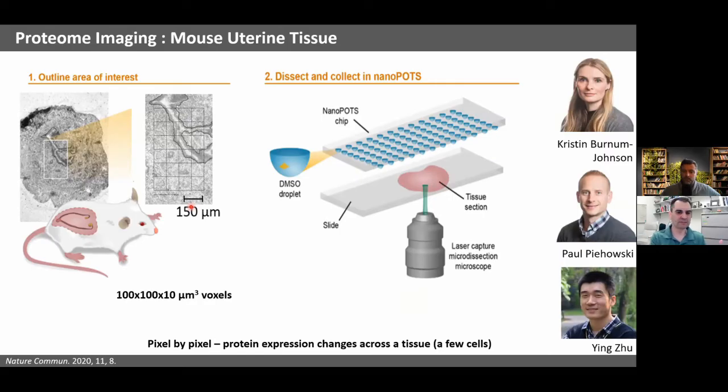And we've used this workflow combining laser microdissection with nanopots to map across tissues with whatever spatial resolution you're into. There's a trade-off between proteome coverage and spatial resolution.